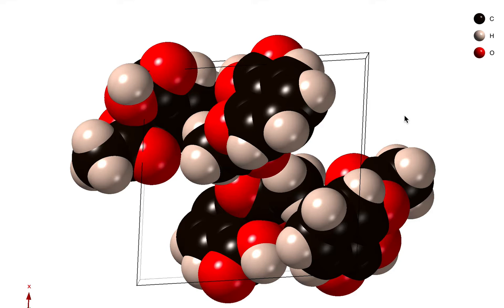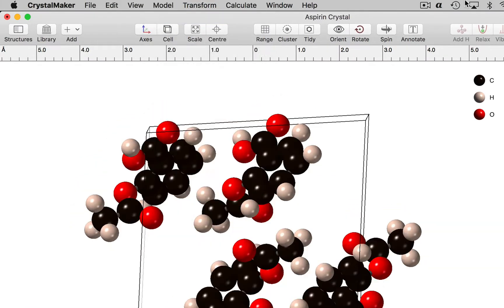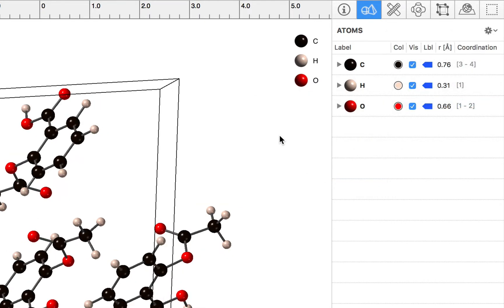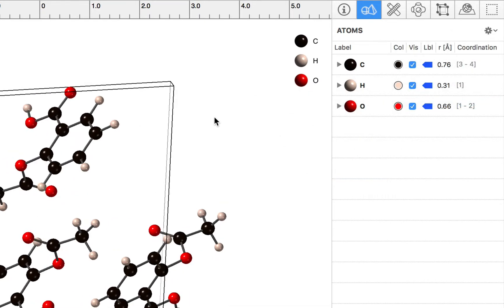So a better method might be to use a ball and stick plot and overlay some kind of surface. Let's go back to ball and stick and reset our radii to the covalent radii that we were using before, and let's put a surface over this model.